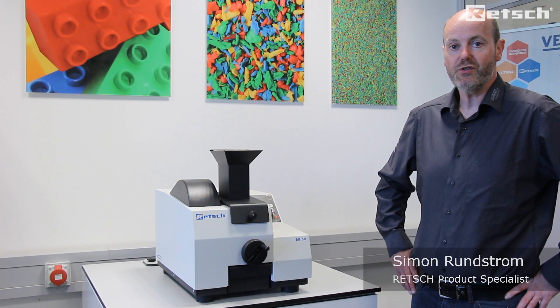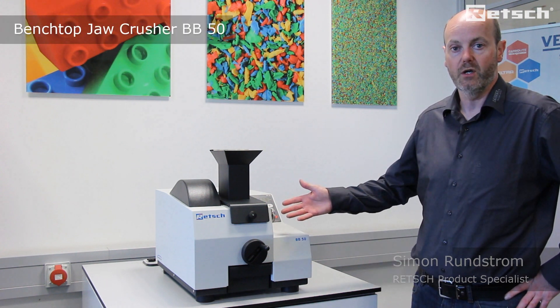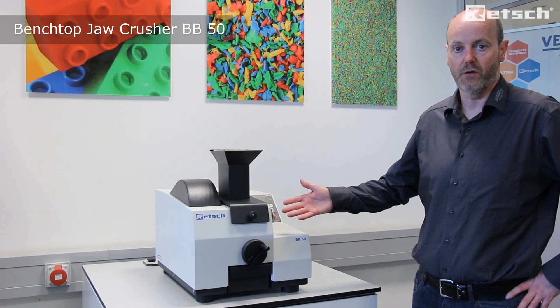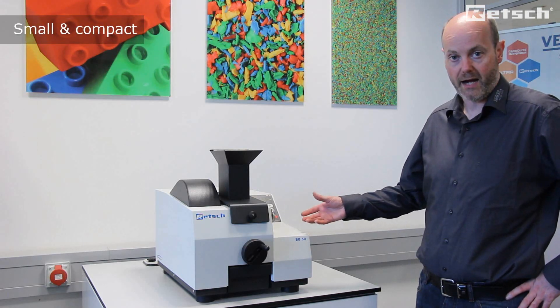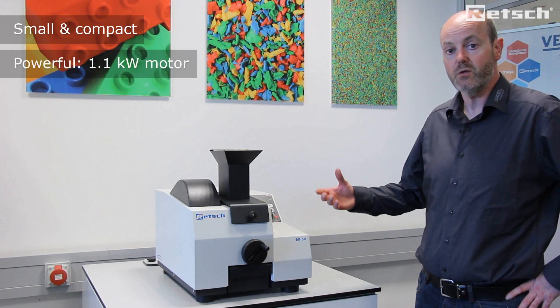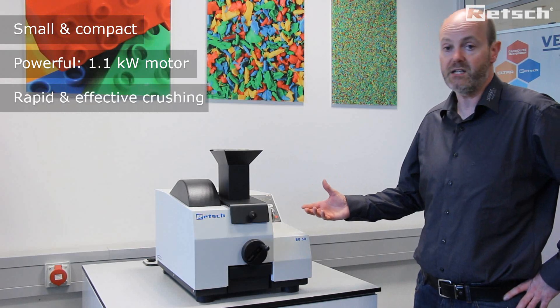Hello, I'd like to introduce the BB50 Benchtop Jaw Crusher, which sits within the family of jaw crushers. It is a small, compact yet powerful jaw crusher fitted with a 1.1 kilowatt motor to give rapid, effective crushing.